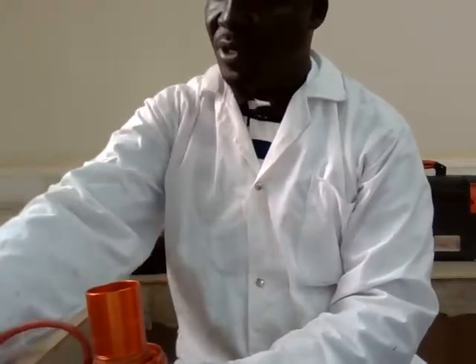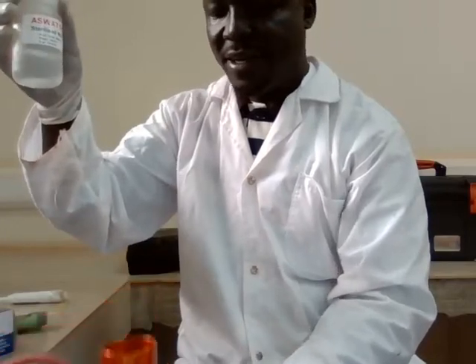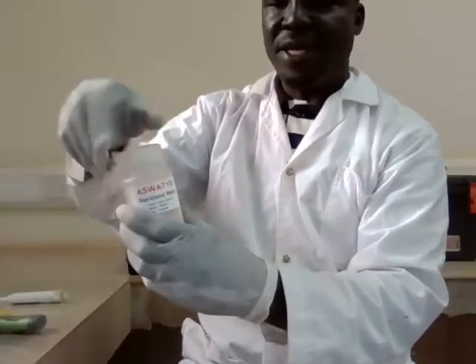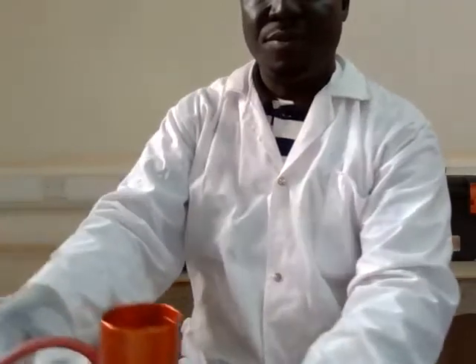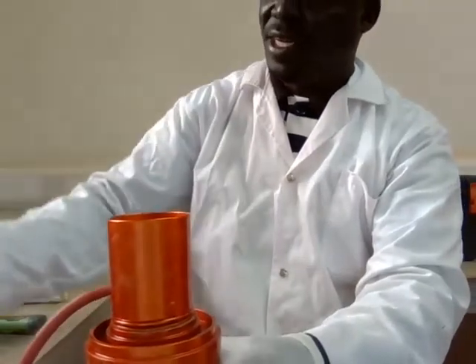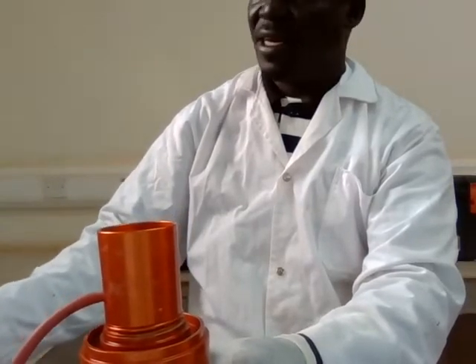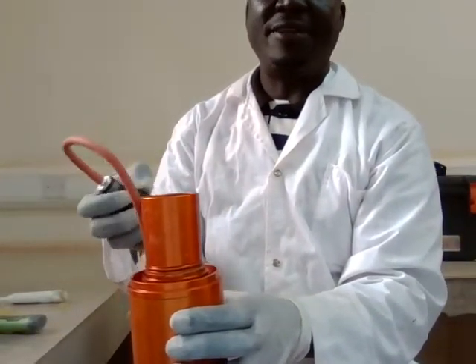Then you are going to now use the sample. Let's assume that this is our specimen that we've got from the field. You are going to open this specimen and then you pour it up to the mark that you see. If you put it at the first ring there, that means you've used 50 milliliters of the sample. And if you fill up to here, that's 100 mils.